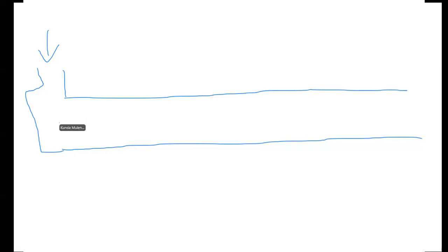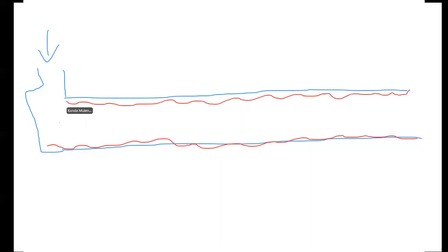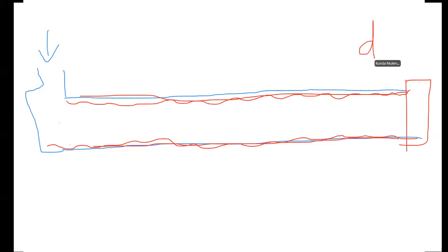Now remember, along this column here, we need to have it coated with a substance, but remember, there's a little bit of heat that is involved in here. So what happens is that we're going to have some vapor along the walls of the column, and then this side here you need to have a detector. I think I will have to look for the instrumentation so that I explain it better.